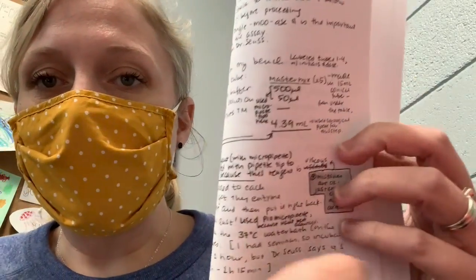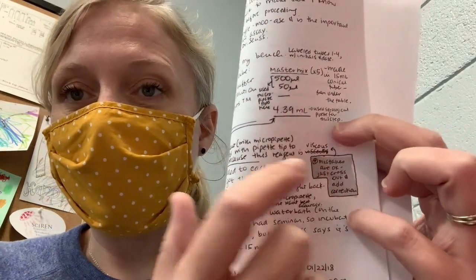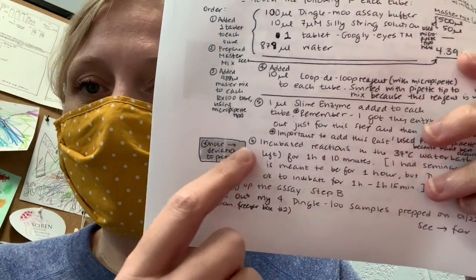It's okay if you make mistakes in your lab notebook. You usually want to just cross them out. And you also are going to note deviations from protocol. So a protocol might say incubate for 1 hour, and you talk to me or someone in the lab and you figure out that you can incubate for 1 1/2 hours because you have to go to class or something. That kind of deviation needs to be noted in your notebook, so that if something weird happens, like it works better or doesn't work as well, you can go back and trace your steps.